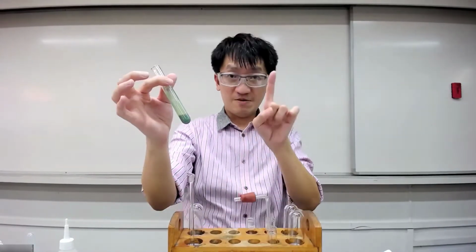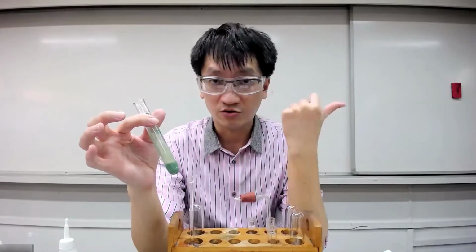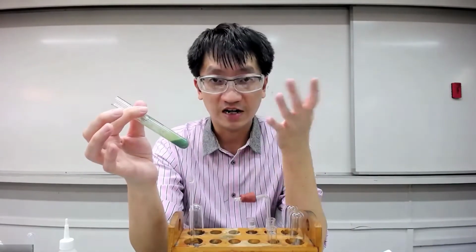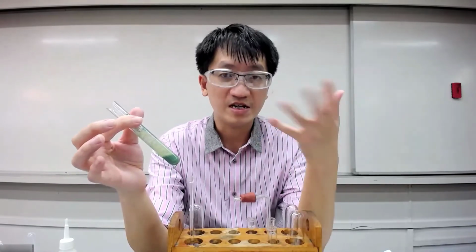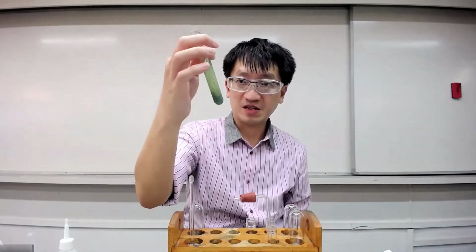So effervescence, remember, is the word which you should use for gases like CO2, oxygen, and hydrogen. Yeah, so in this case, effervescence of colorless, odorless gas, because you don't smell anything, and then gives off a white PPT in lime water. So that's what you should be observing. Okay, so I hope this is clear enough.